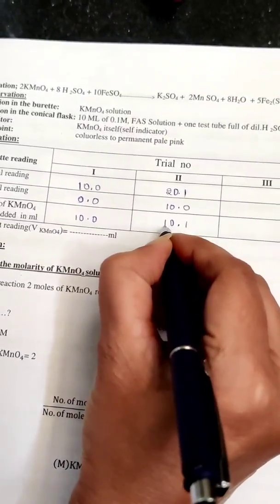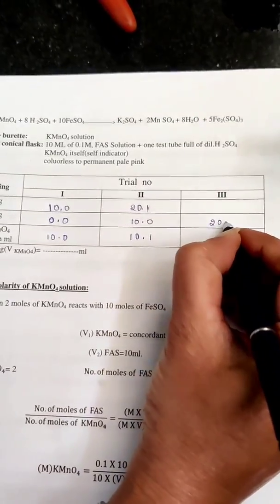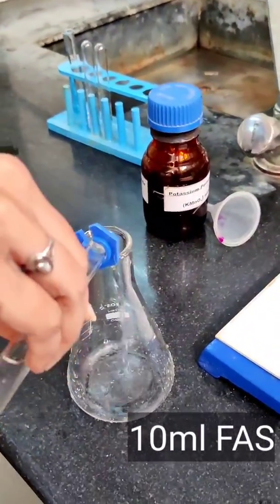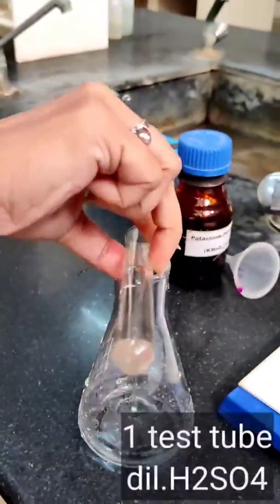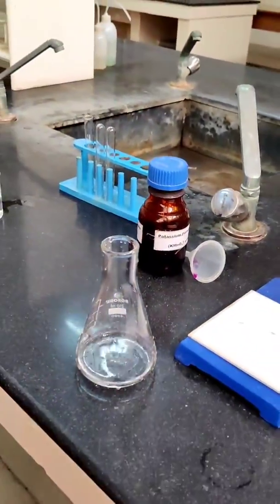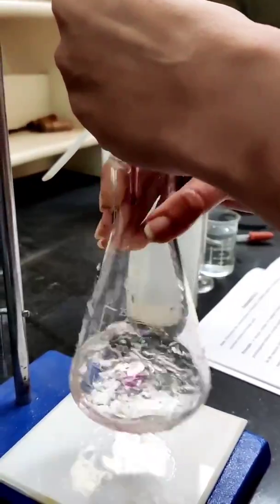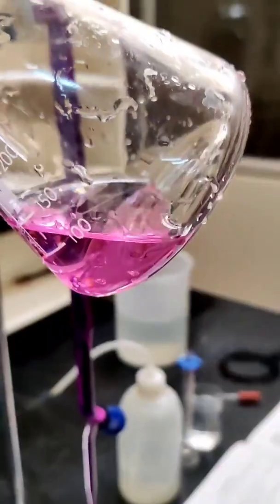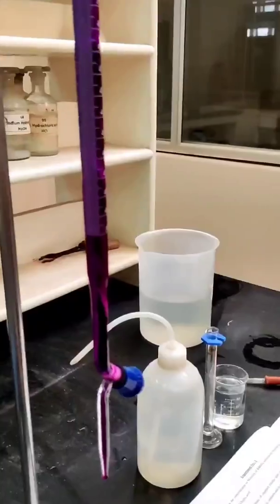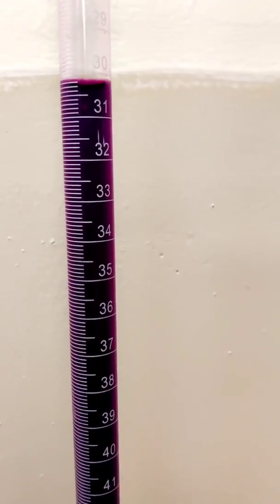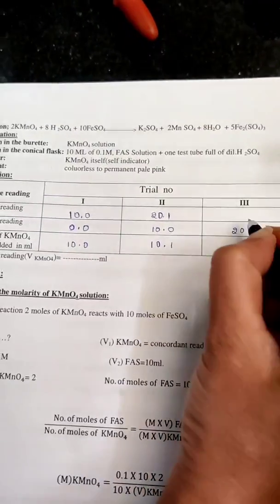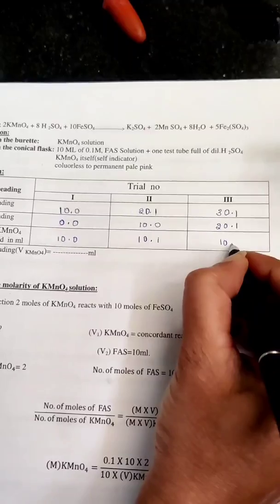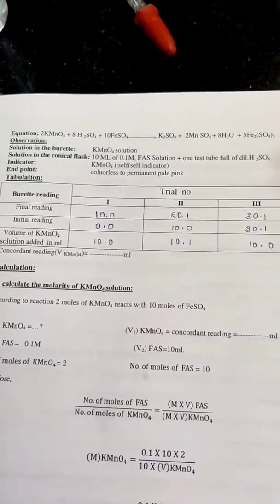Do the subtraction to get the final reading. The second final reading will be the initial reading for the third trial. Again, I have taken 10 ml of FAS and one test tube of dilute sulphuric acid. I got a pale pink color. Note down the reading. After the third trial, take a concordant reading.